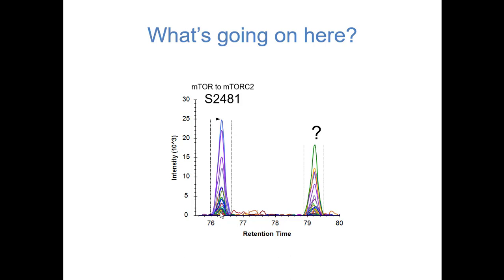So in your precursors, for example, when you're doing your precursor scan, if you've got just one really abundant peptide, say a big keratin or a big trypsin peak, it's going to shift the precursor masses of all of the other peptides away from what their true mass is supposed to be. With DIA, because we're doing these wide windows, but much narrower than 400 to 1600, you actually have much less chance of seeing another big peak along with your peptide of interest.